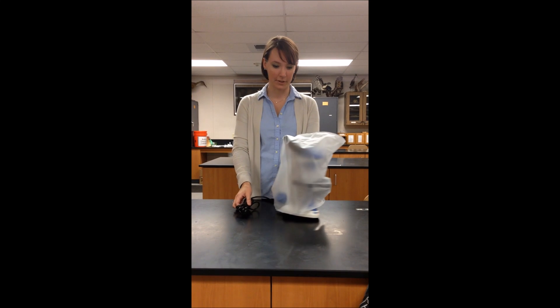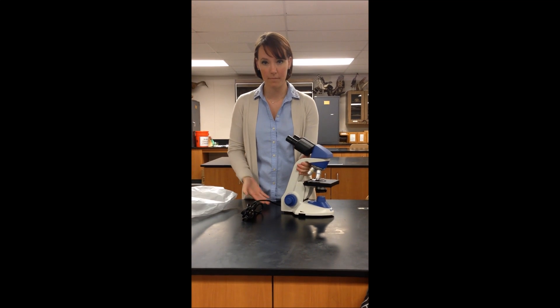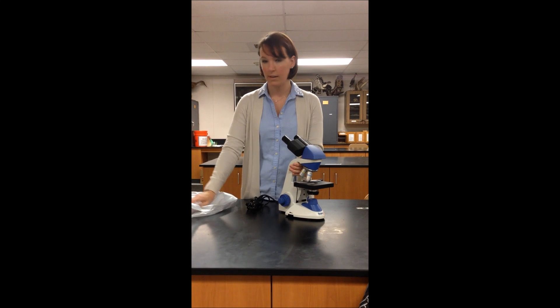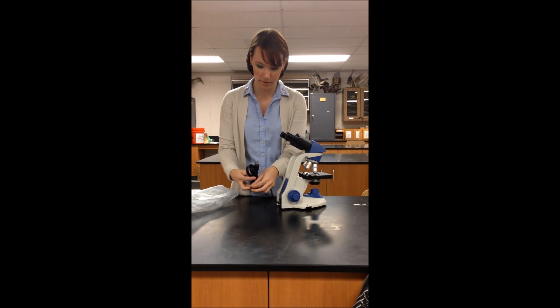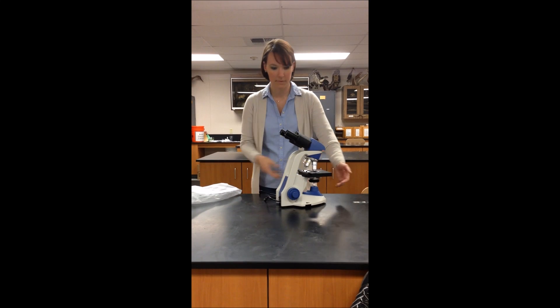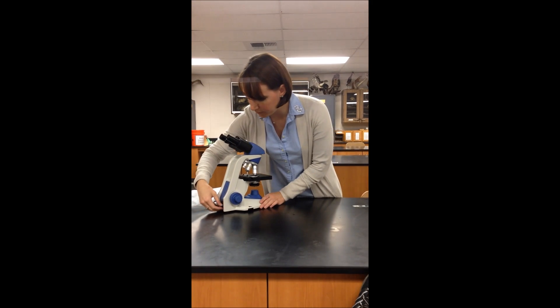In order to properly carry a microscope, you're always going to grasp it by the arm and have one hand underneath as you're carrying it from the cabinet over to your table. Take off the dust cover and unravel the power cord. Position the microscope facing yourself and turn it on.